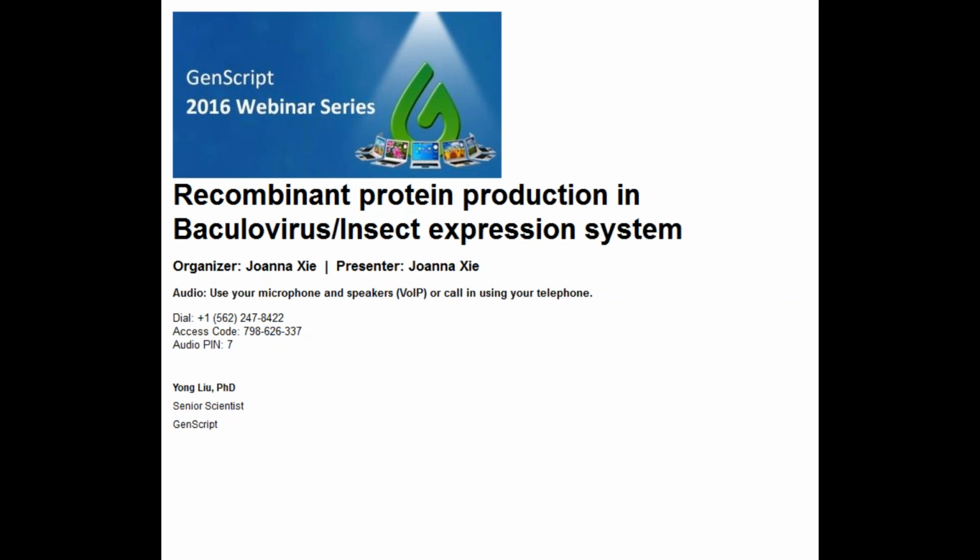And so I have hands-on experience with the different expression systems, including insect, E. coli, mammalian, and yeast systems. So in line with my experience, on behalf of Andy, I'll discuss certain aspects of recombinant protein production in a baculovirus system, insect expression system. During the webinar, I'll also highlight some of the services that will potentially match your needs and your downstream application. So with that, let's move on.